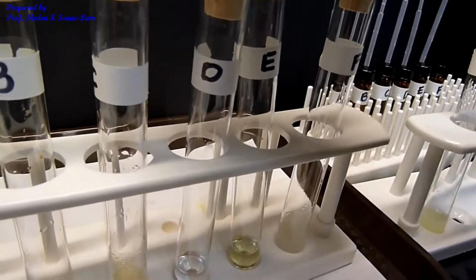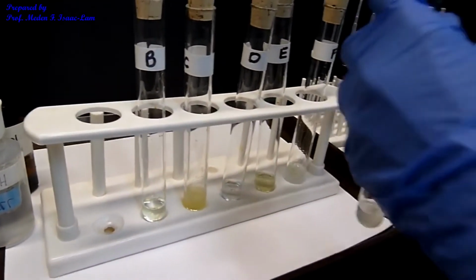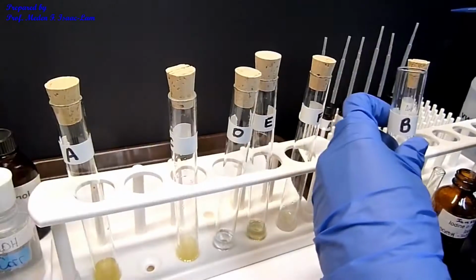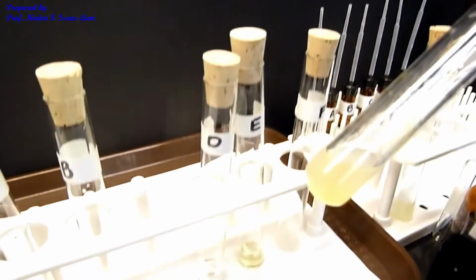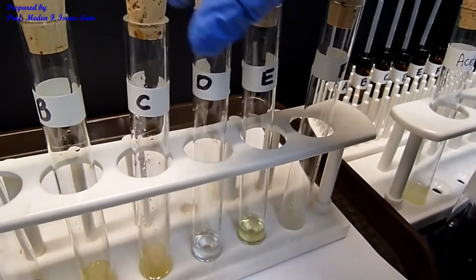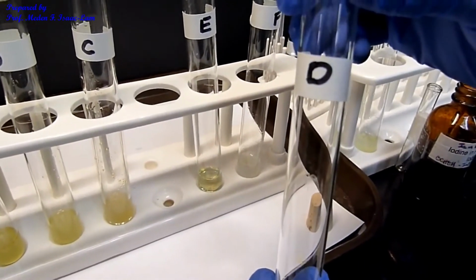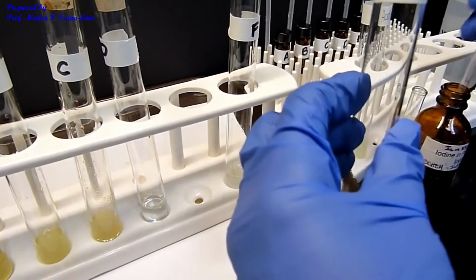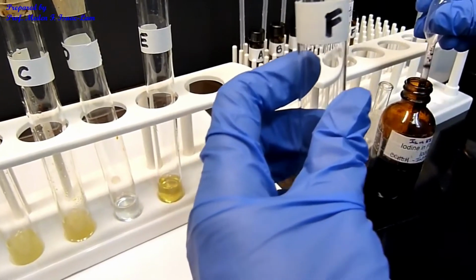So I'm going to add on each 10 more drops just to increase the amount of the iodine. So 10 drops. I will not add any more on this because I already see a precipitate on C. But I will add on D. Okay, so this is D. And then E. Last one, F.